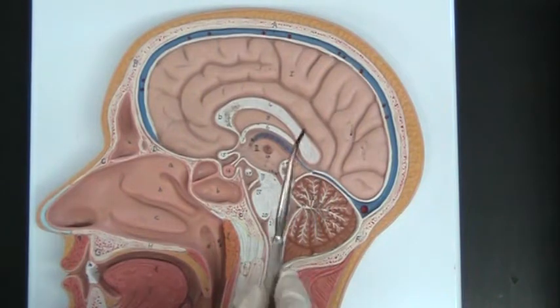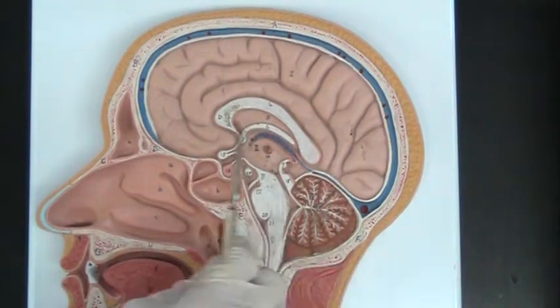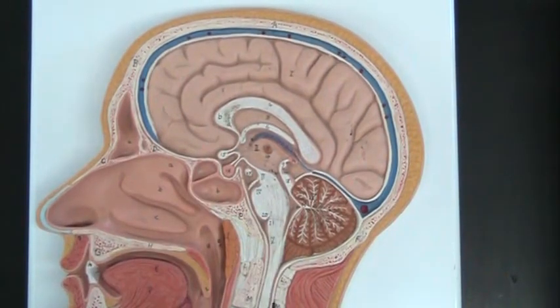And let's see, the other part of the brain that I want you to be comfortable with is in the center of the brain. First off, your spinal cord comes up, and when it's in the brain, it's your brain stem. Your brain stem is made of three different parts. The top is the midbrain, the first bump is the pons, and the second bump is the medulla oblongata. I think of them as switching stations when they're sending impulses where they need to be analyzed in the brain, and of course sending effector nerves back down to respond.